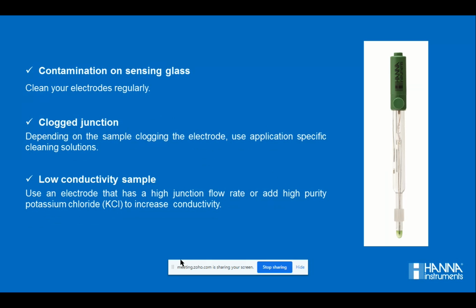So why does contamination give erratic readings? Contamination might give erratic readings, or might give wrong readings, or might give readings slightly lower or slightly higher than expected, because of the deposition of the samples or any other material on the electrode, the millivolts of that deposition add on to the millivolts of your sample, and might give positive or negative interferences in your reading.